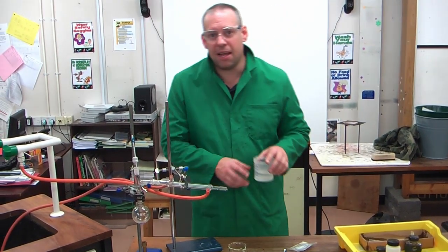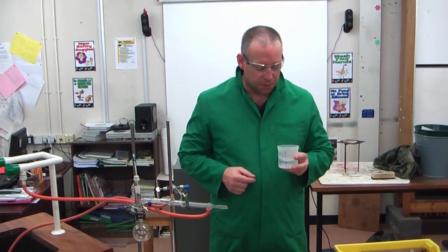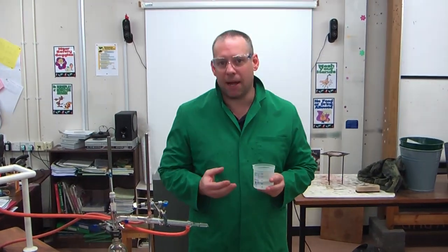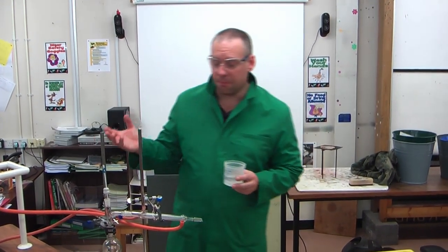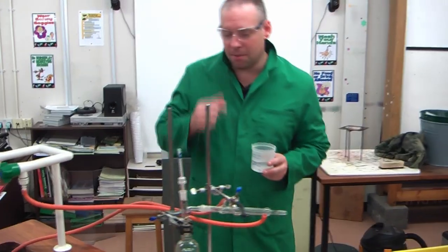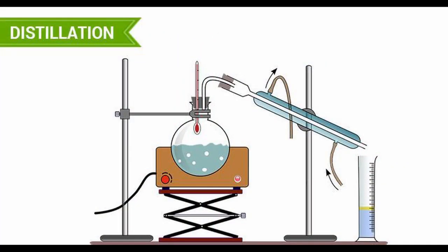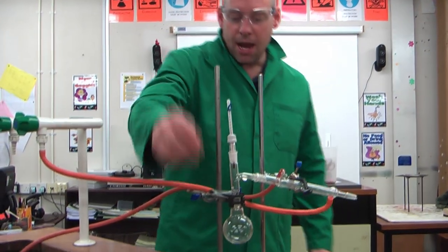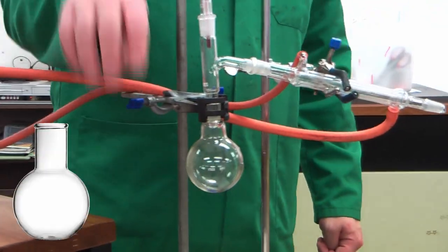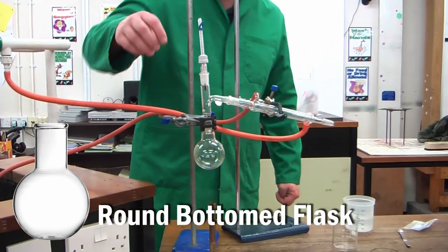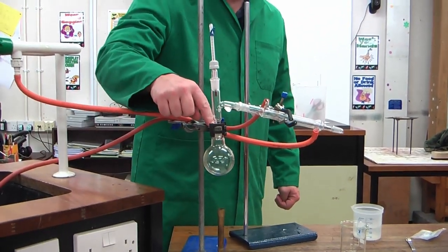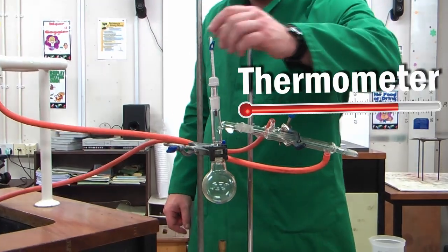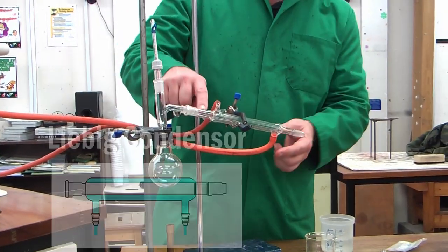So what to do then if we've got a solution of a solute, which is dissolved, and we want to get the solvent back. In this case, I've got salty water. I want to get the water back. I can't use evaporation. The water will have disappeared. So I need to use a different method. The method we use is this. This is called distillation. Now, distillation involves a couple of pieces of equipment that I want to just point out to you and show you. This bit here has got the lovely name. It's called a round-bottomed flask, which is just a flask with a round bottom. It goes up the top. We have a sidearm delivery that goes here. We have a thermometer to keep an eye on the temperature.